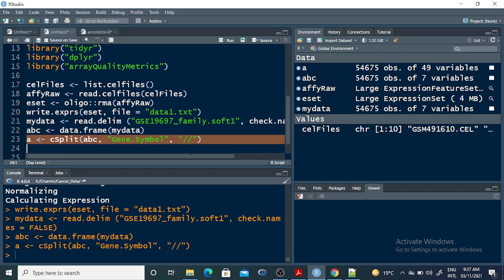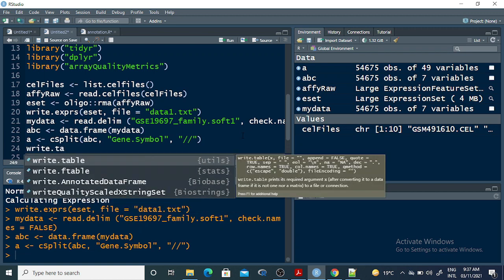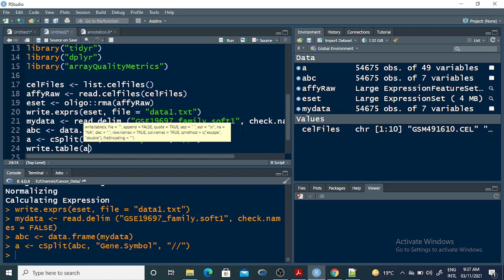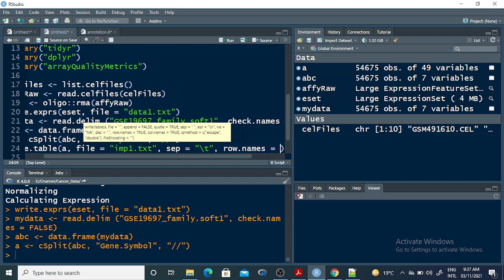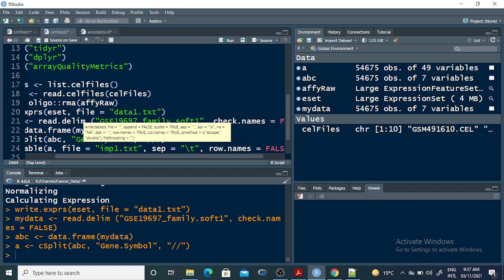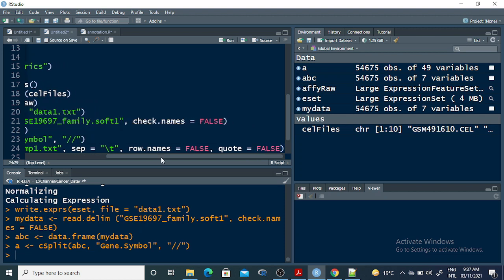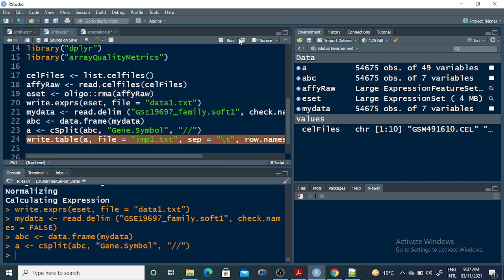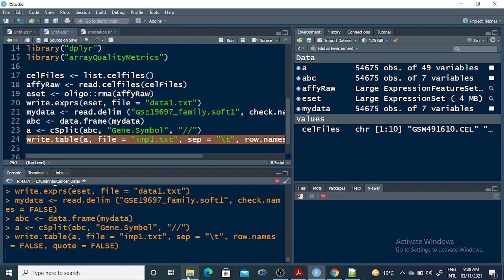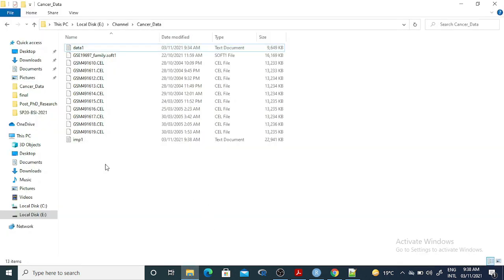After splitting, I save the result into a new file called import1.txt: write.table(file, 'import1.txt', sep='\t', row.names=FALSE, quote=FALSE). You can see the new file has been created. The slashes have been resolved, and if you want to inspect this in detail you can open it in Excel.